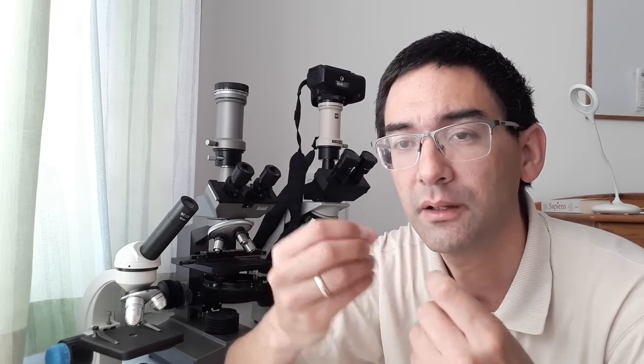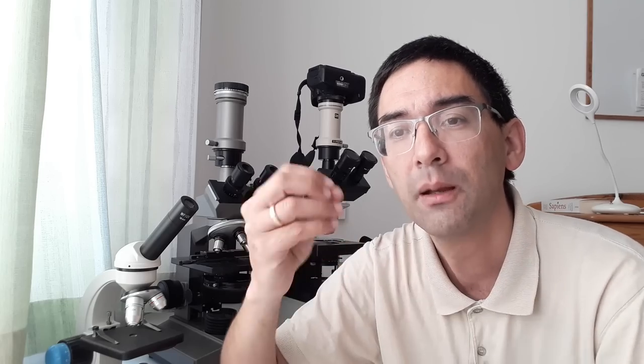Yogurt contains bacteria, they contain cocci, a little bit difficult to see because there's so much other stuff in there as well, milk and fat particles and so on. But if you're careful enough, you can see all the bacteria, the cocci in chains from yogurt. In my other channel there is a video where I put a water sample from a rotten plant flower under the microscope.